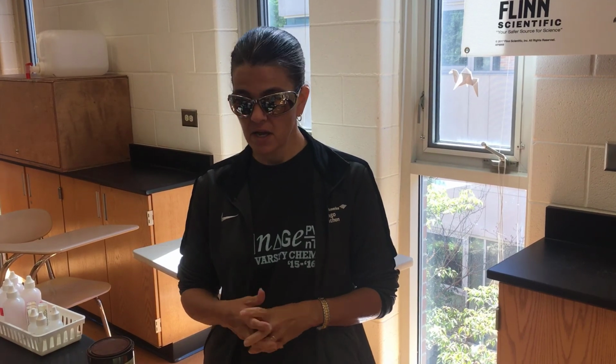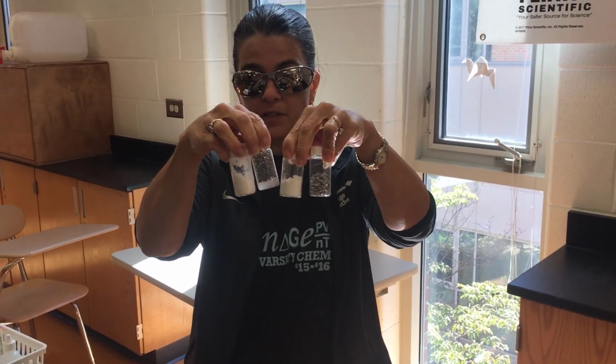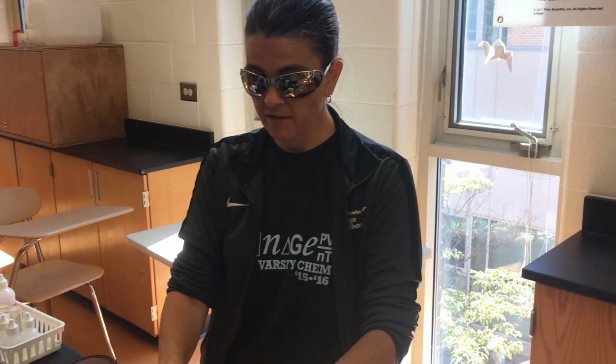Okay, so now the challenge round. This time we're not going to tell you the formulas for the substance, so you can't decide the type of bondings and interactions that are going on from the formula. You're going to have to figure it out from properties. So you're going to have 4 unknowns. Your job is to figure out what type of bonding they have.